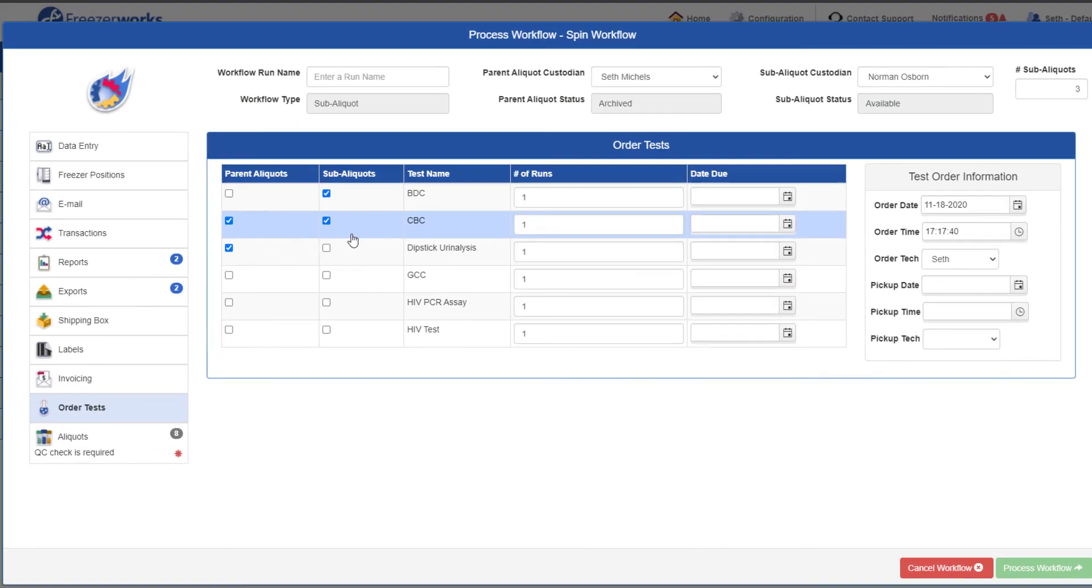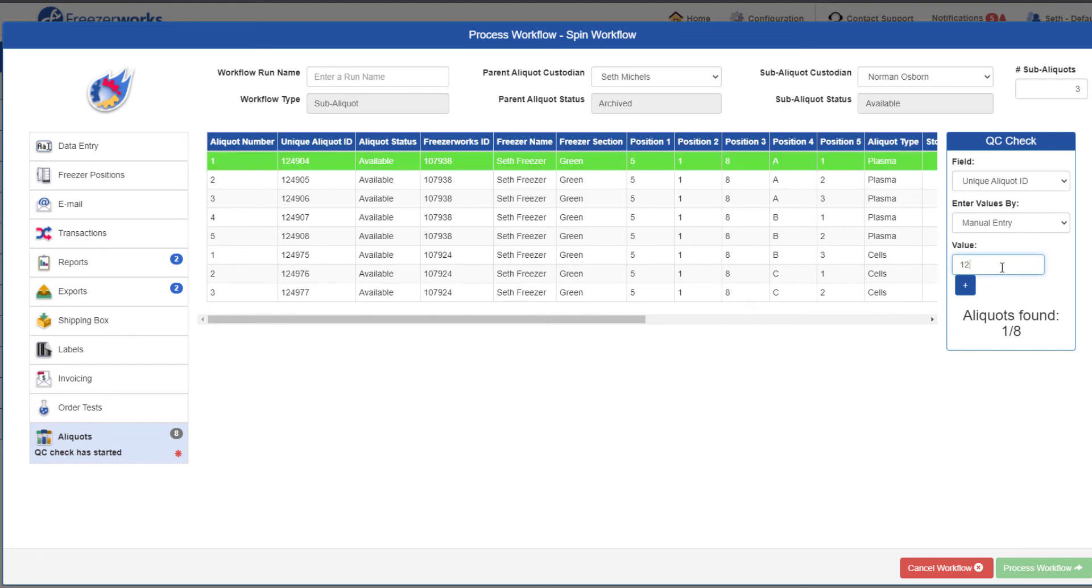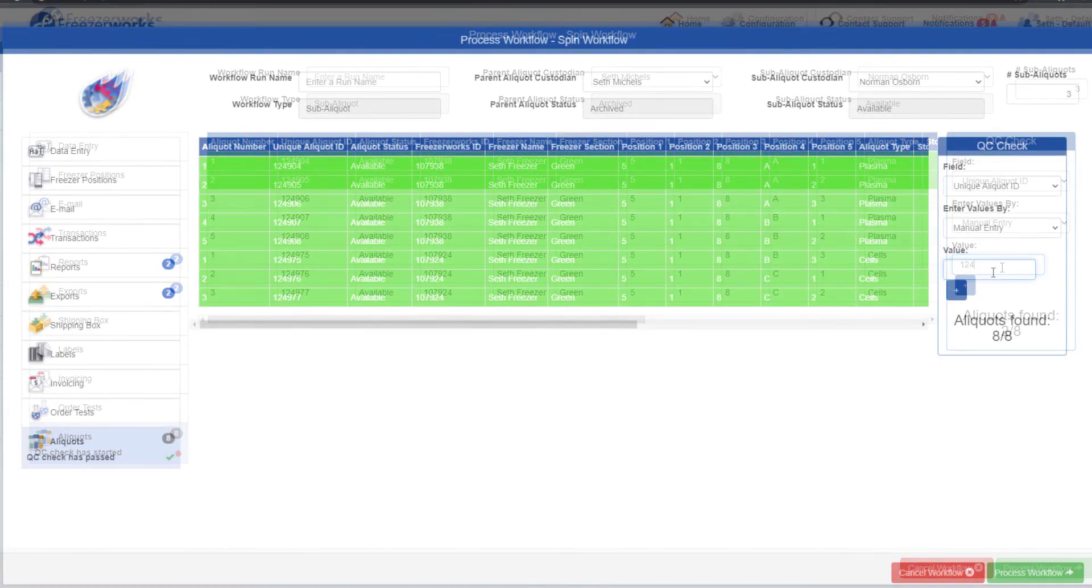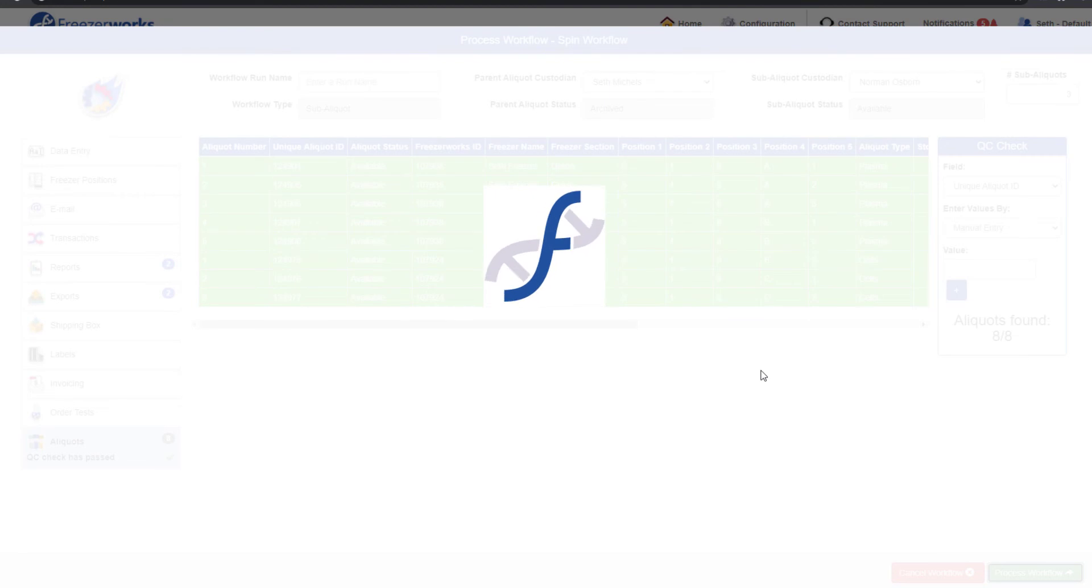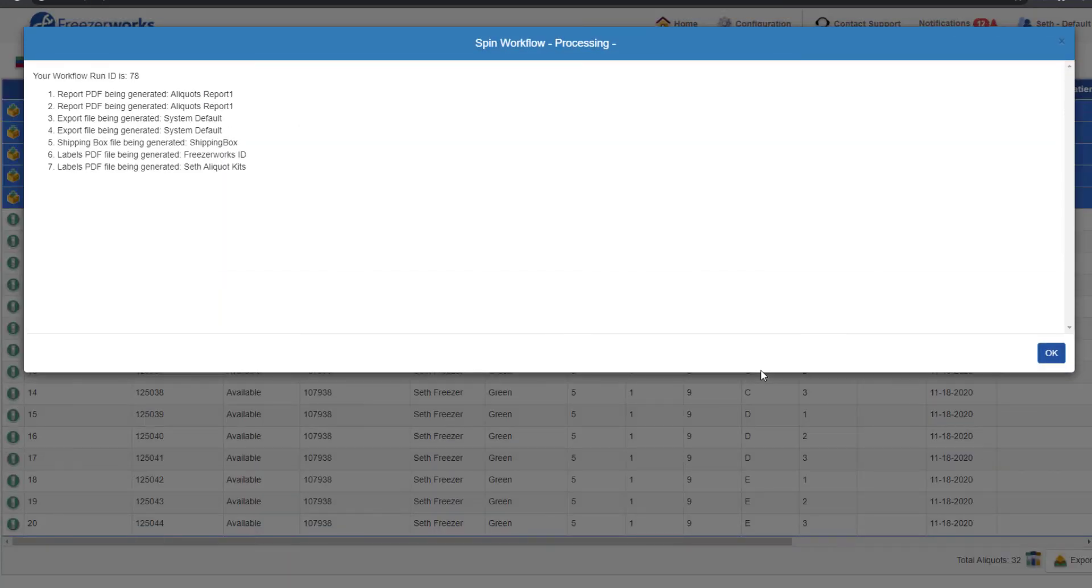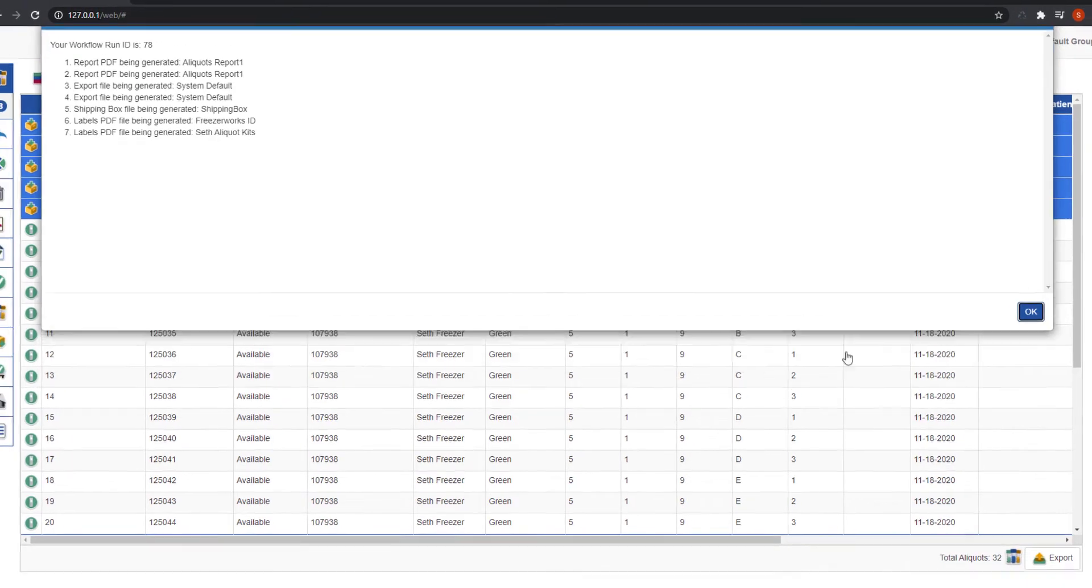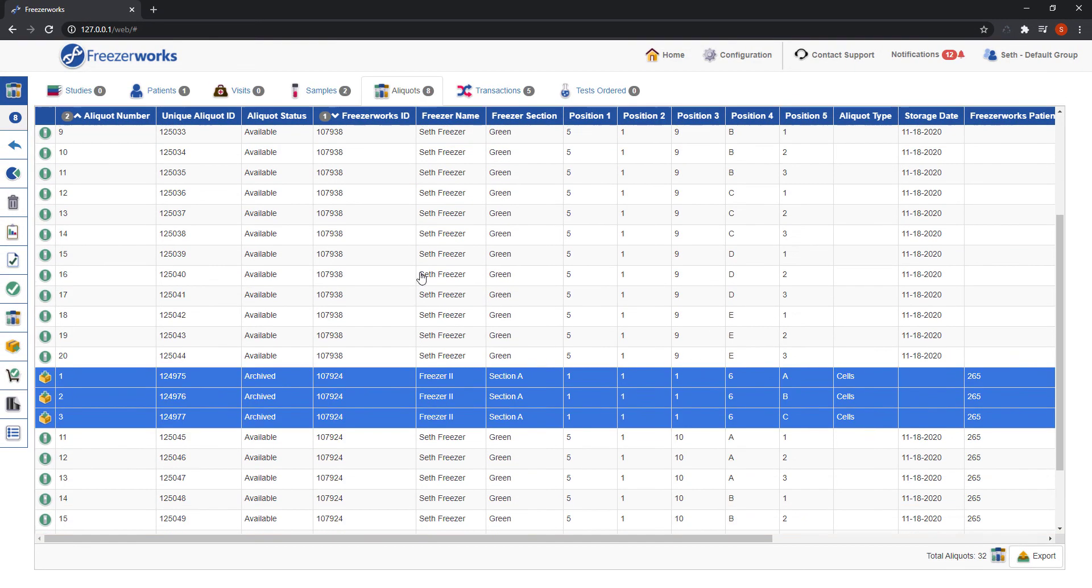Finally, we come to the aliquots page, where a QC check is required. Obviously, you only need to check the parent aliquots you're running the workflow on, and not the sub-aliquots that are being created. Once you've finished that and all other required tasks, you can process the workflow. Click through the confirmation, and you should see both the aliquots you ran the workflow on and the new sub-aliquots that were generated.